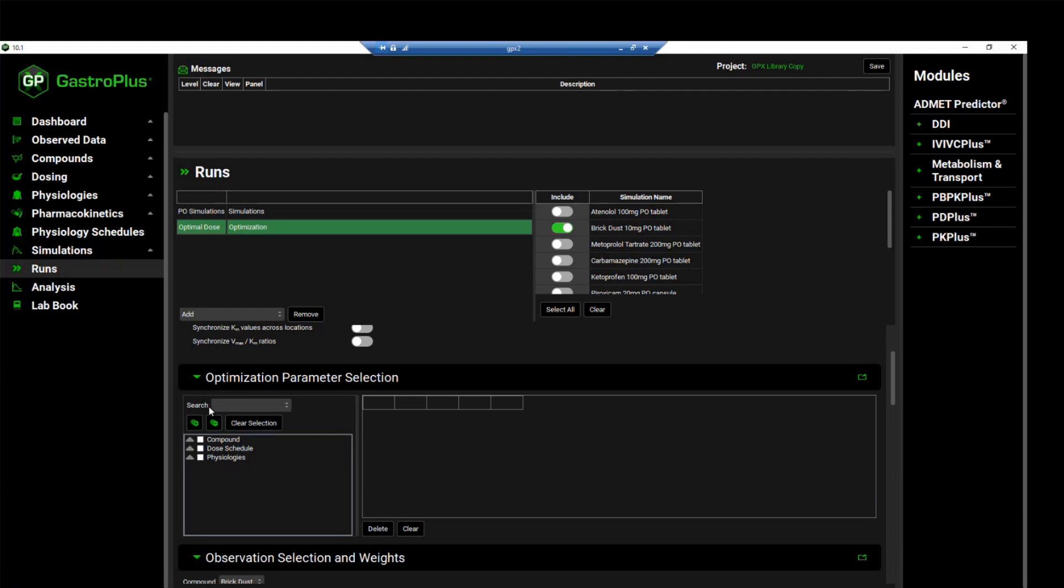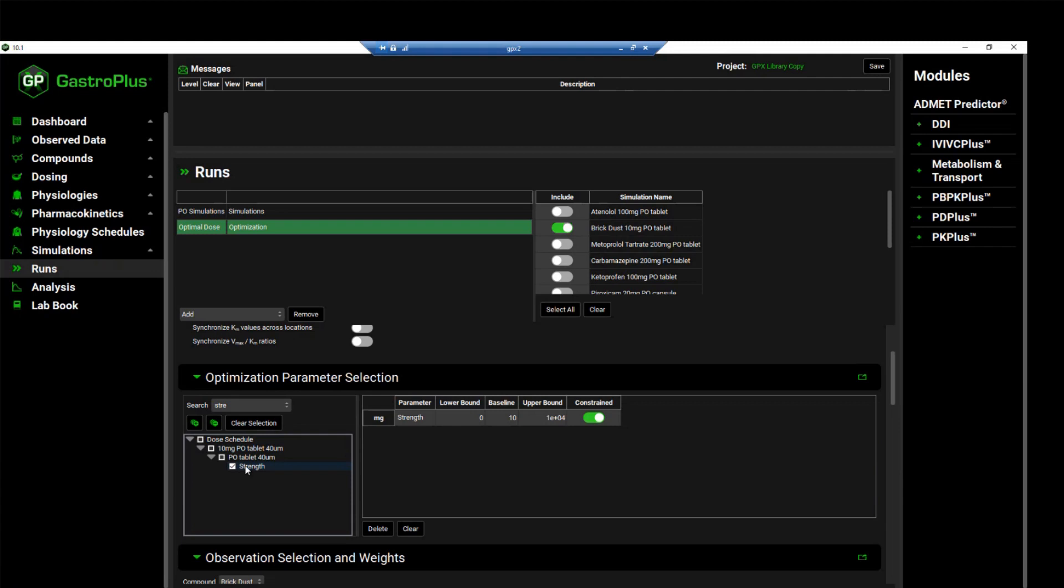We will move to the optimization parameter selection, and we will use the search bar to find the dose strength, which is the parameter that we want to optimize. Type STRE and hit enter, and then you can select the box next to strength. Once you've done so, you will see that the table on the right hand side will be populated with the selected variables to be optimized.